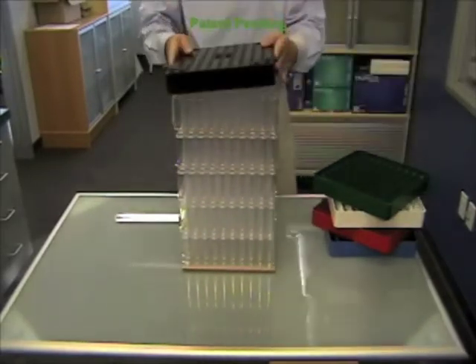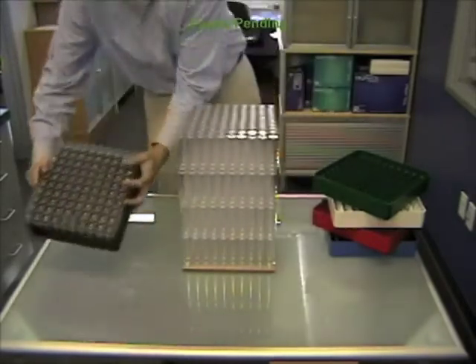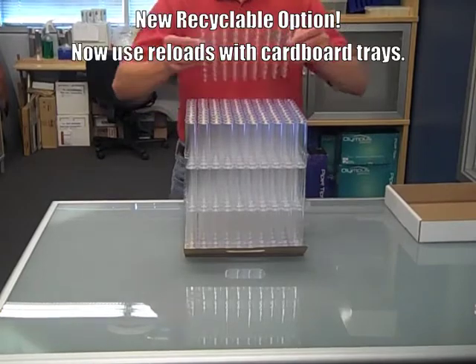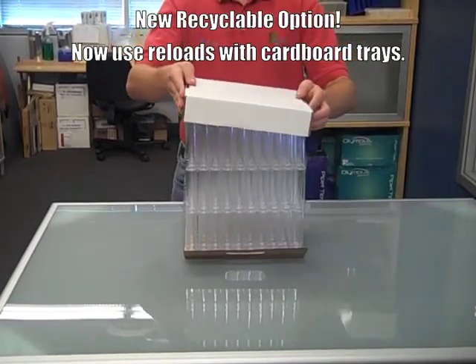Carefully position the reload tray above each layer of vials to load them. Reload vials are now compatible with traditional cardboard trays using the new recyclable option.